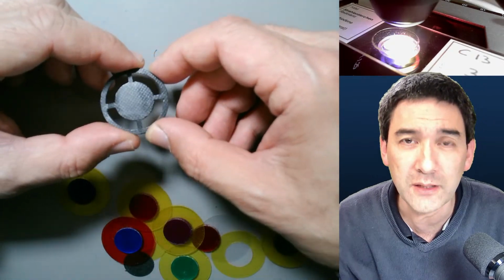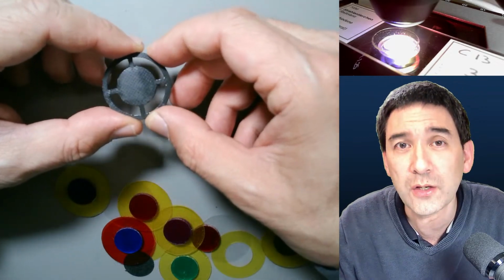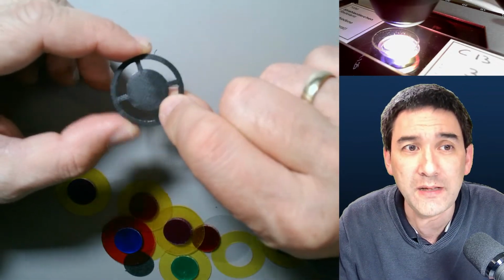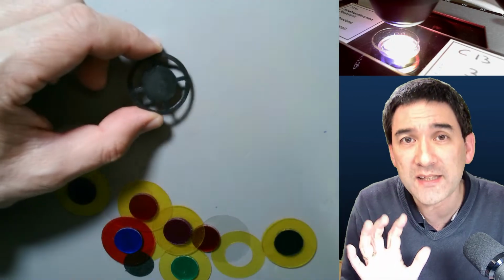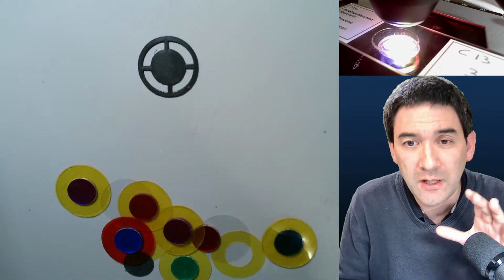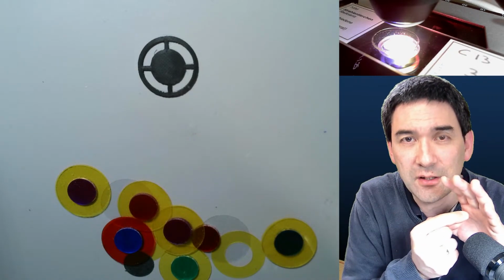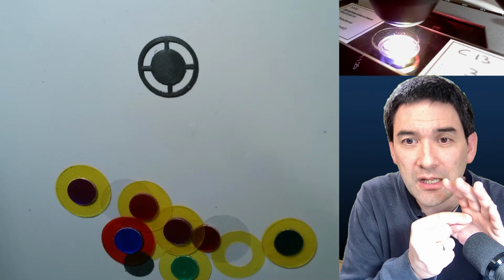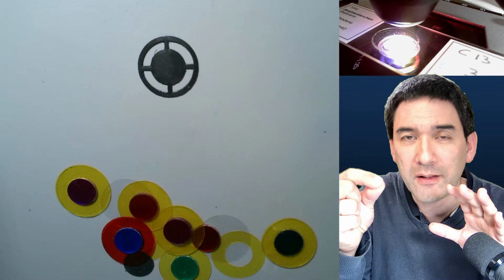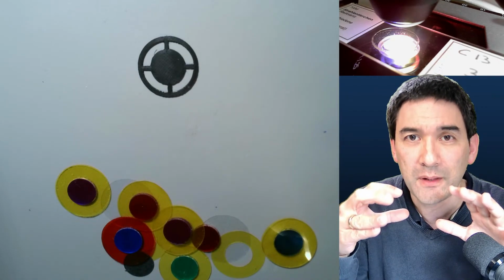That's expensive. There are now also other possibilities where you're using a condenser which does not have a disc, but which has a concave mirror system. What happens is that the light which comes from the bottom bounces against the concave mirror in the condenser and is redirected diagonally away. So you're gathering much more light this way.